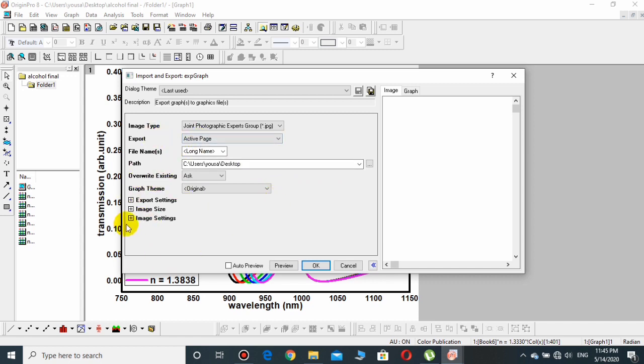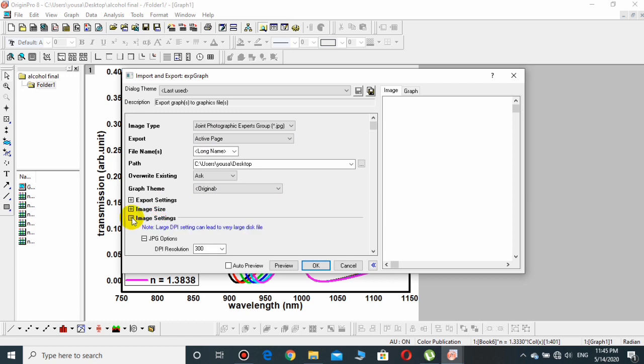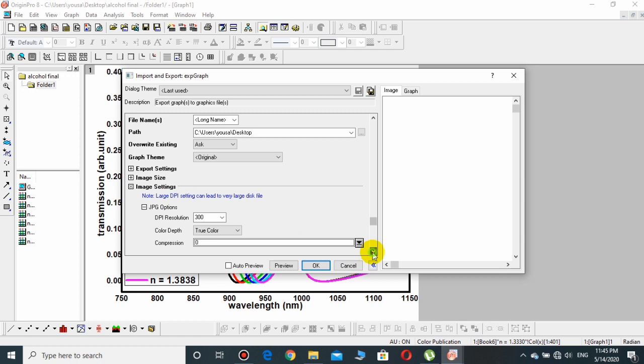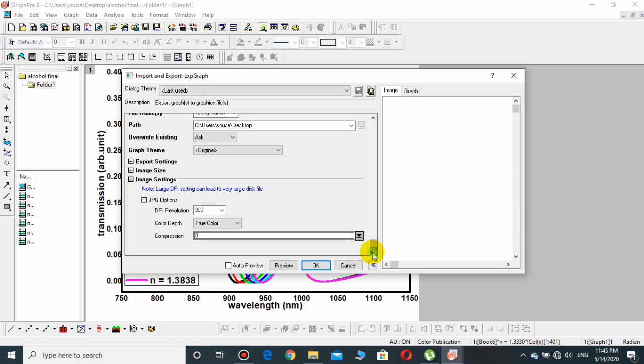The most important of these is the Image Settings. Click over this plus sign and another options will be displayed. Here, the most important one is the DPI resolution, that is the dot per inch resolution.